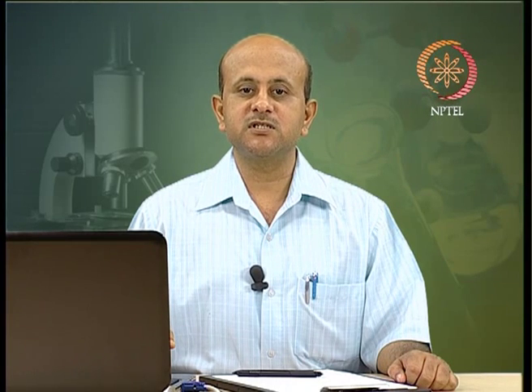The simplest rotor has two cells. One is called the analytical cell and another is called the counterpoise cell. The counterpoise cell has two holes to facilitate the calibration of distances in the analytical cell, and a variety of analytical cells are available with volume capacities from 0.02 to 1 ml.